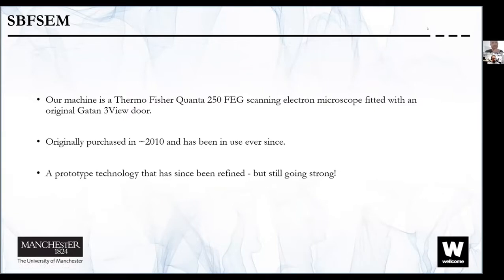Runs take several days, and we've had a lot of runs in our time. So yeah, that microscope's been chugging along, done some great work. There have been advancements in the technology since we got it, and there are more up-to-date versions that have technologies that allow them to get a better resolution and a better Z resolution, importantly, aka a thinner slice thickness, because a lot of the trouble with this technique is just trying to get the knife to cut properly. But that's something I have to worry about, not any users.